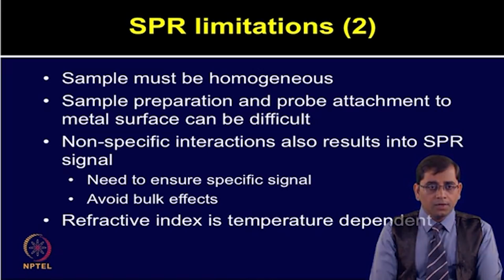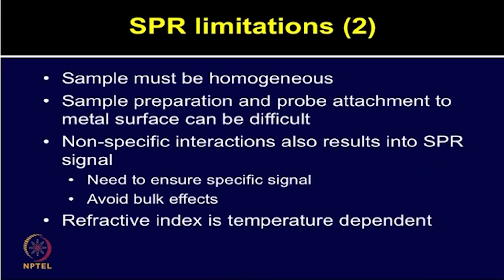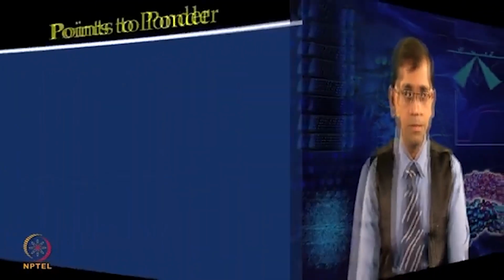Lastly, refractive index is also temperature dependent. So, these are some of the limitations associated with SPR. However, it is still one of the very promising label free detection platforms.